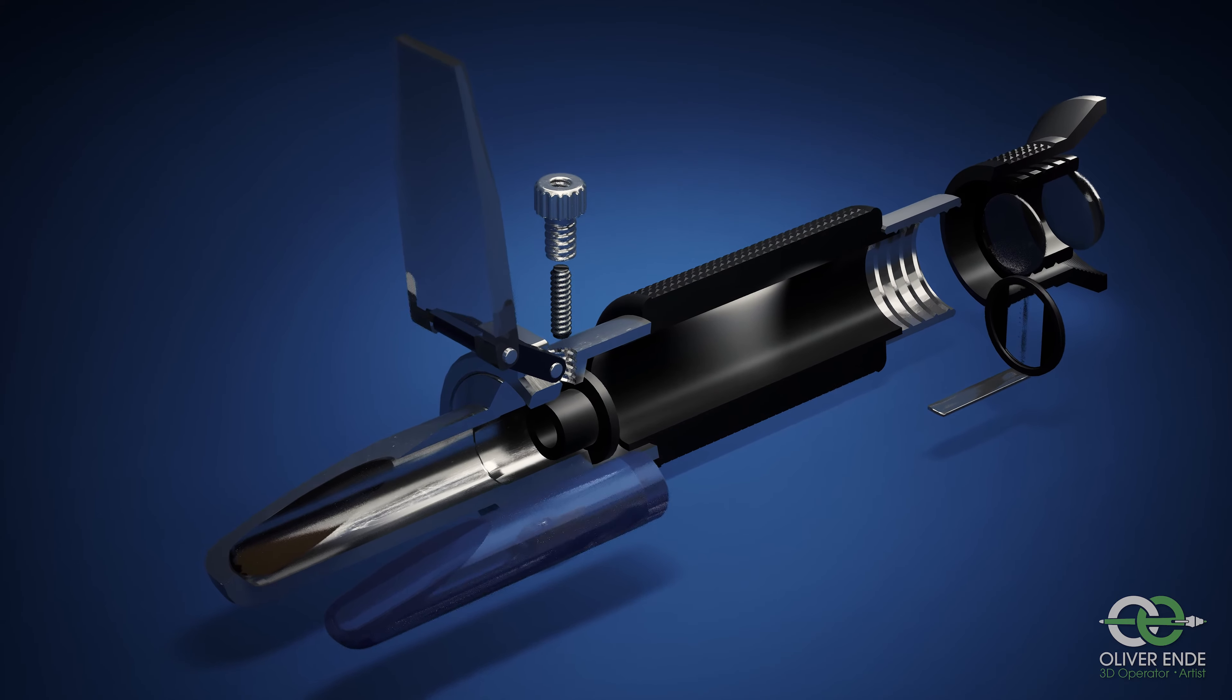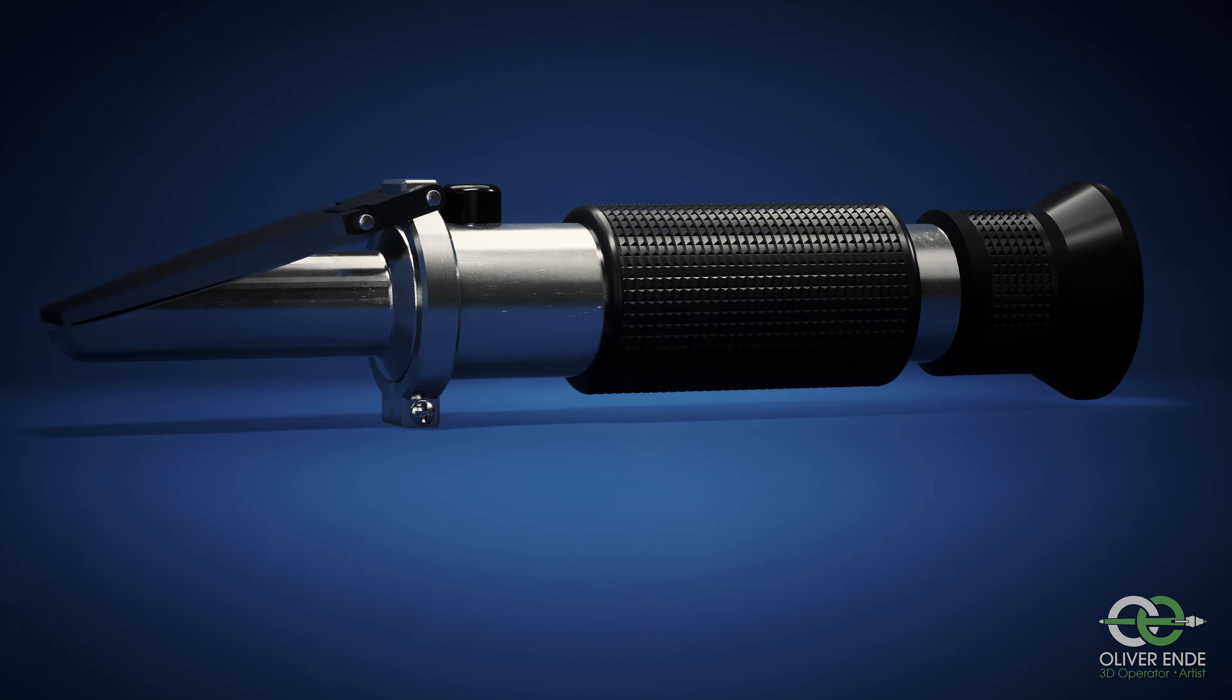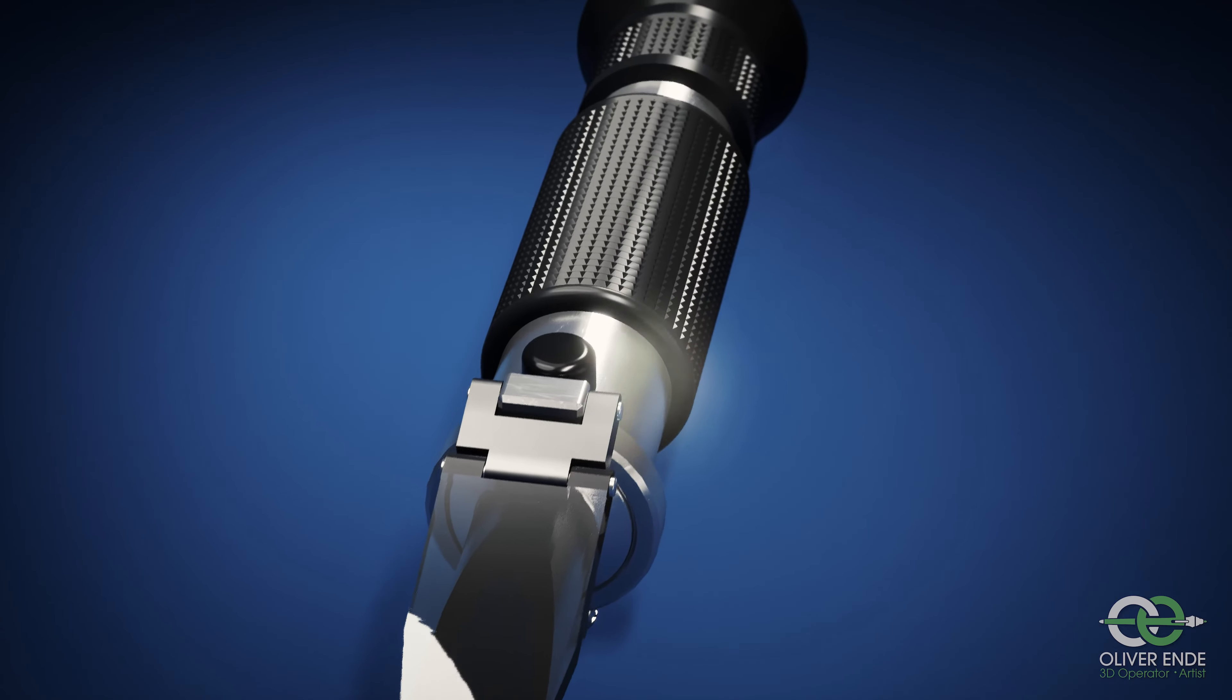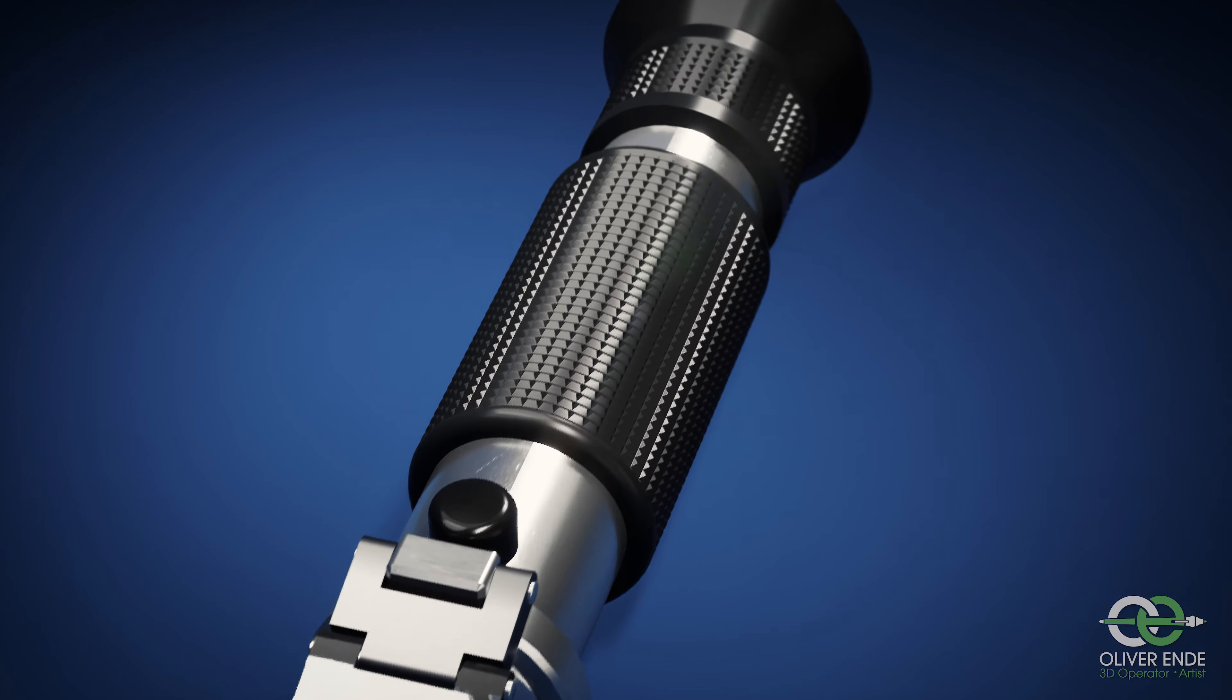The refractometer is a measuring instrument that determines the refractive index of liquid or solid transparent substances by refractometry.